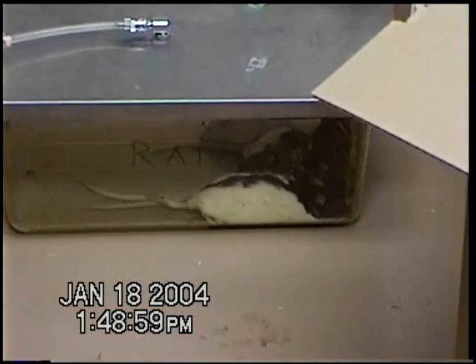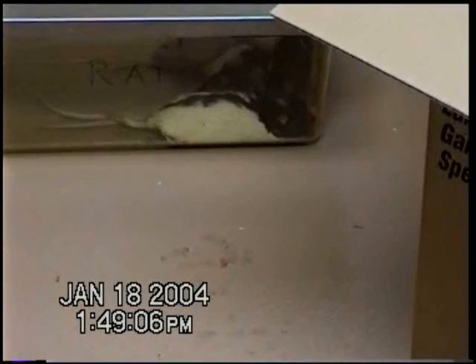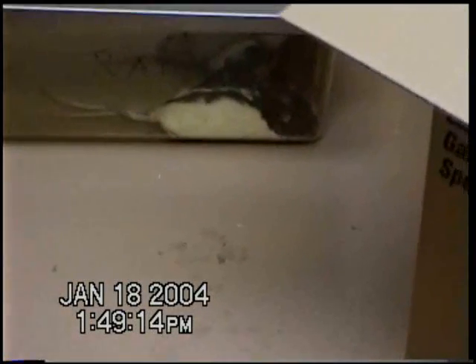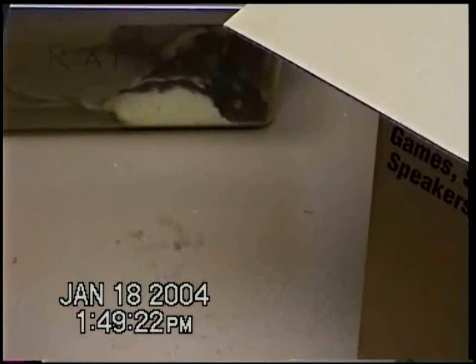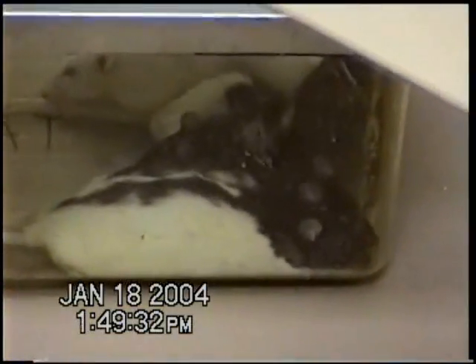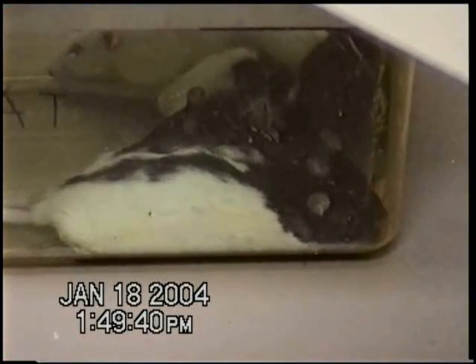Again? No. Now it's about one minute. Since you want to use this little bit of CO2 which is still there, you can add the rest of them in there too. Let's put the other four or five more in there.